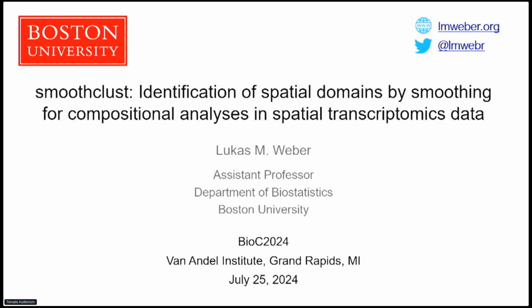Thank you. So I'm Lukas Weber. I'm now at Boston University. I'm talking about a method called smoothclust for identifying spatial domains in spatial transcriptomics data.